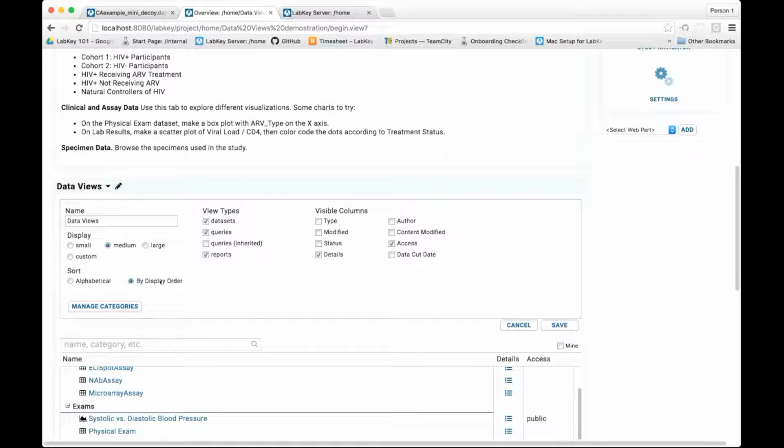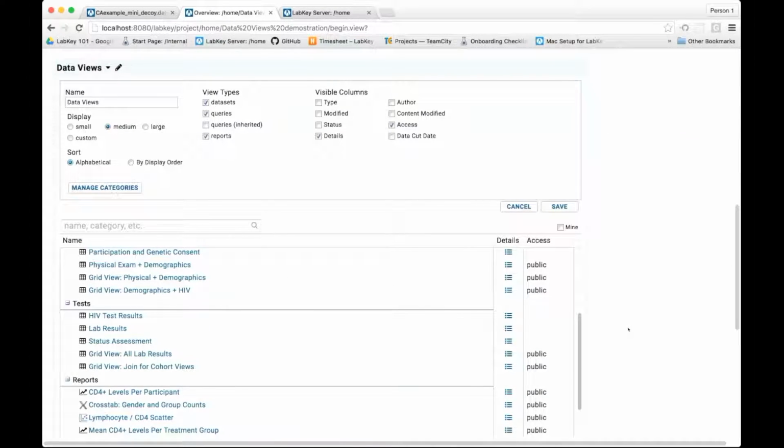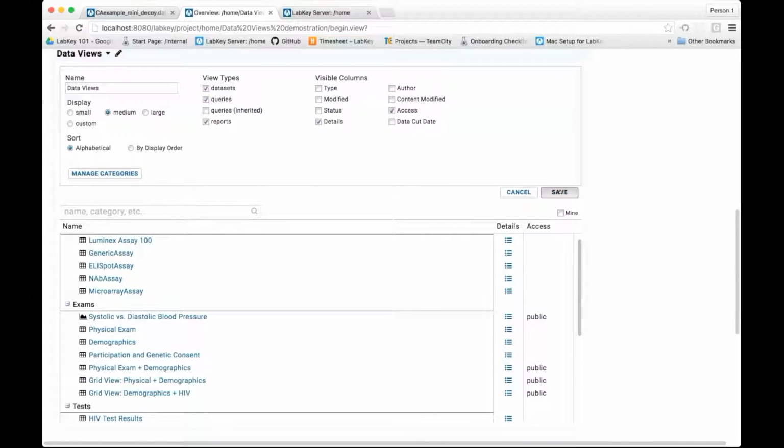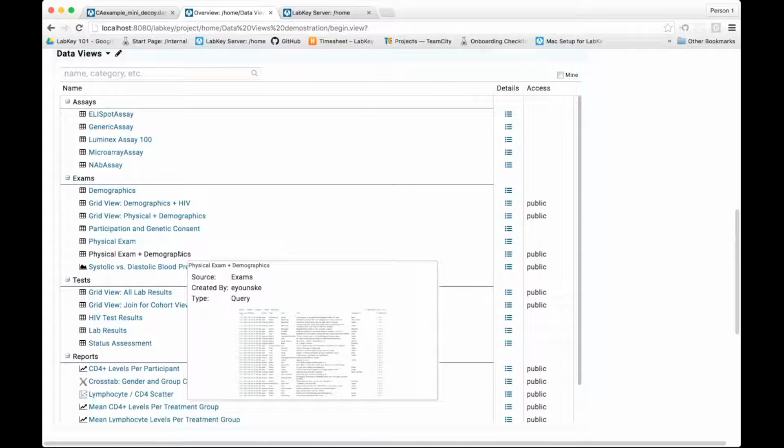So in order to give users and admins a little bit more control over how these are viewed, we now have an alphabetical sorting function. So if you click alphabetical here and then hit save, well, first let's look actually at the reports, and we can see that they are clearly not alphabetically ordered. If we take a look at them, and then we hit save, we can see that all of the reports now are in alphabetical order under each of the categories. Of course, it's within each subcategory or category rather than across all categories. But within a category or subcategory, it should be completely alphabetically ordered.